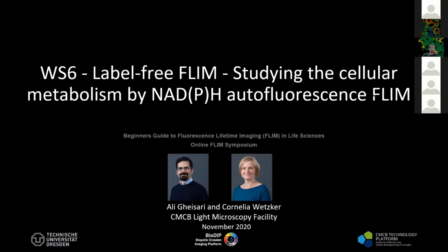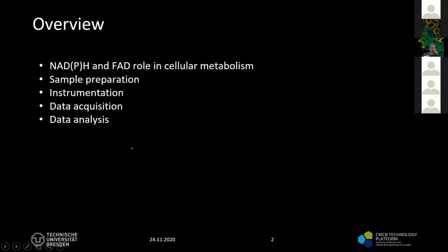So as an overview, I can go to the next page. Yes. Today we are going to talk about the role of NADH, NADPH, and FAD in cellular metabolism. And then we showcase one specific sample. We are going to present some data, some measurements we did with Connie on freshly dissected salivary glands of the Drosophila. She will mainly explain the sample preparation.